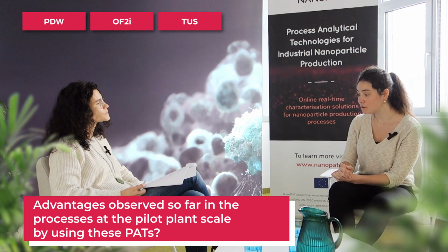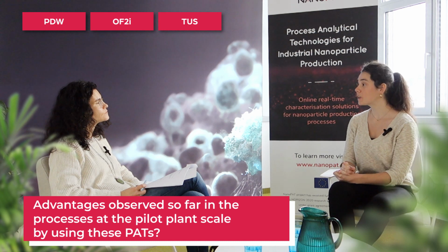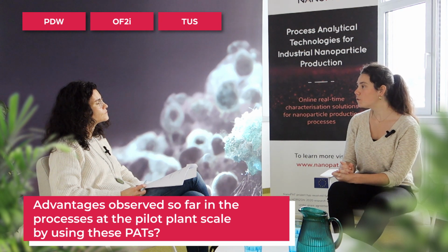And related to the TUS, it's also an online technique. And I will say that one of the most important things of this technology is that we were able to know which the appropriate dilution was in an automatic way.